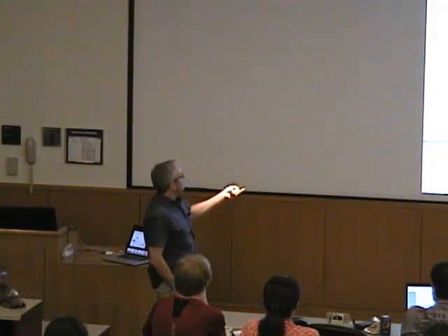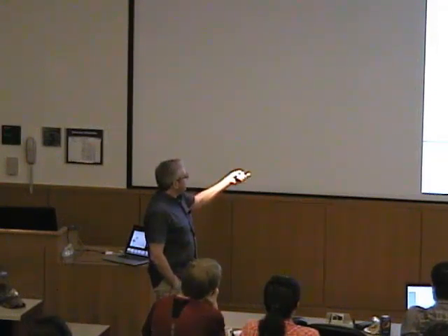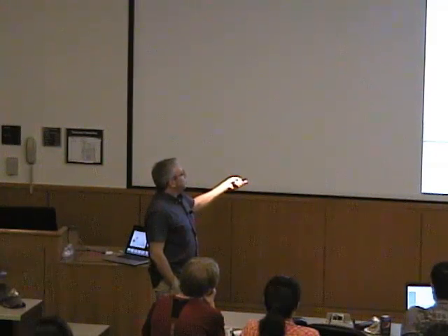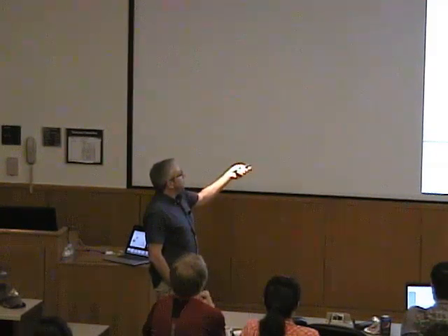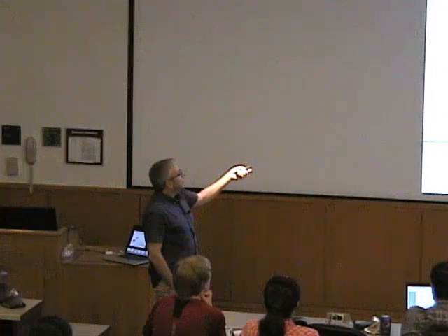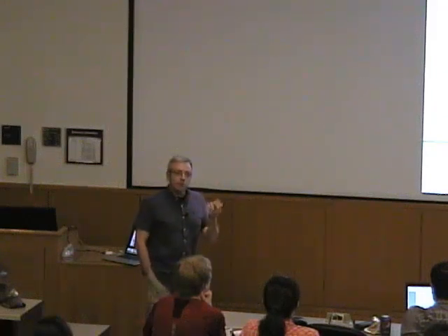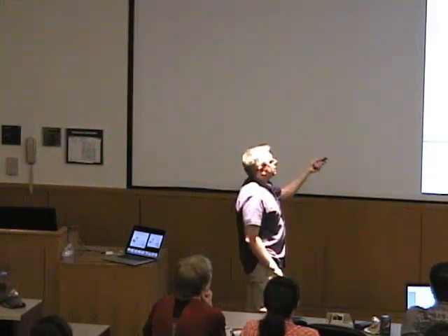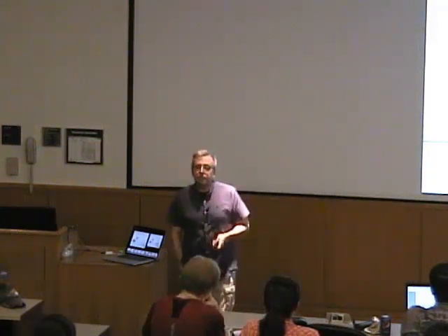They would cause a cascade of signal that would then, through a fiber optics taper, be transmitted to a CCD chip. And that limits what you can do with it, because this cascade that you generate in that first layer creates a certain point spread, which defocuses your image, necessarily due to the technology, because as a cascade you also need this as an additional amplification of your signal.